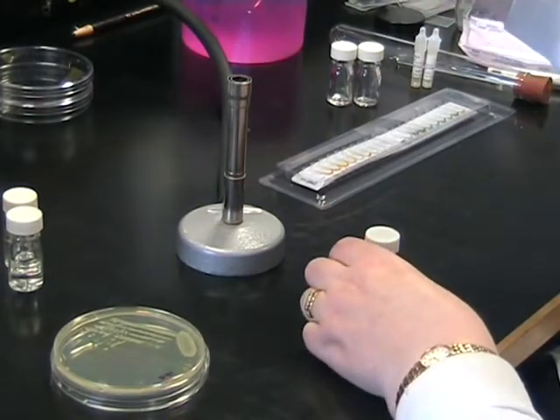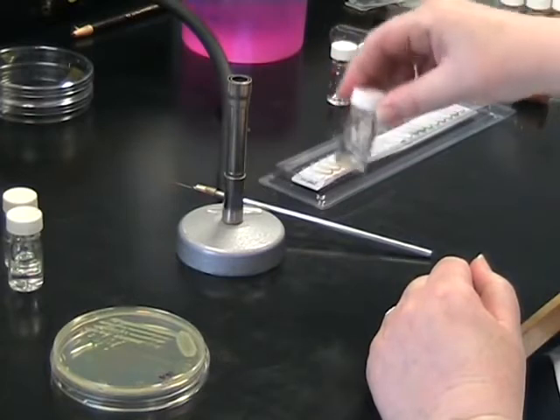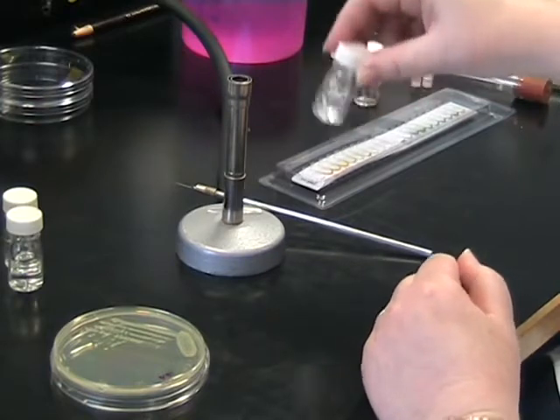Flame your loop and mix your sample vigorously to disperse the inoculum into the water. You should be able to see a nice cloudy solution.